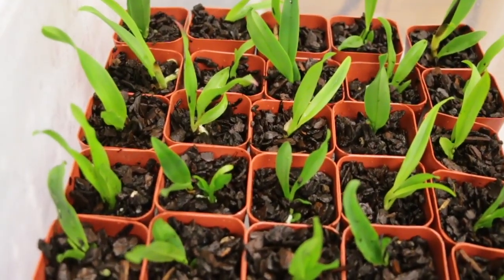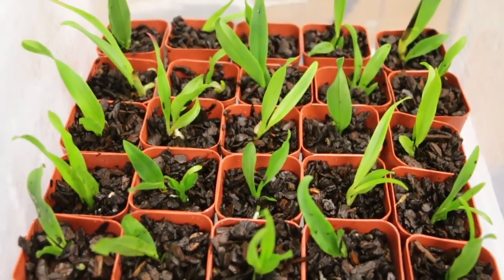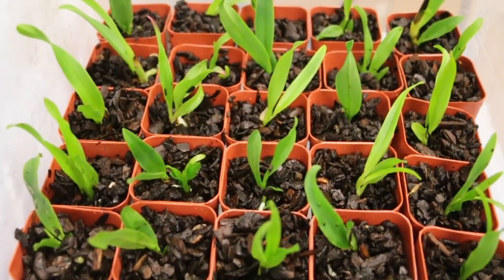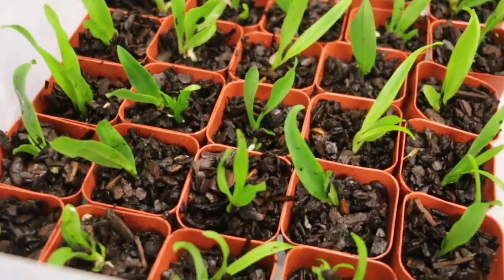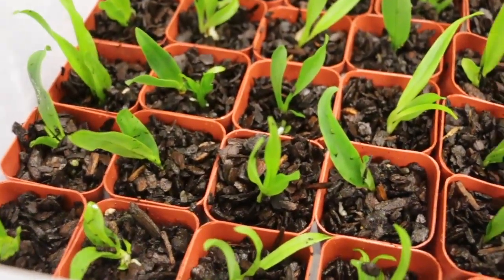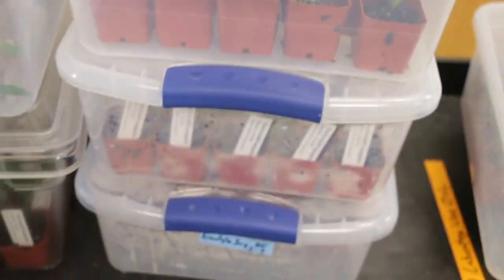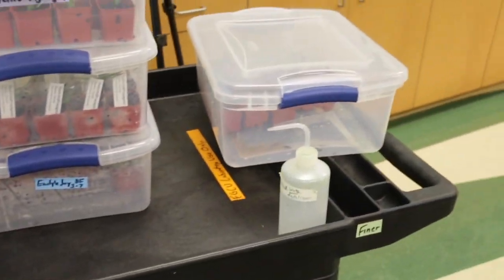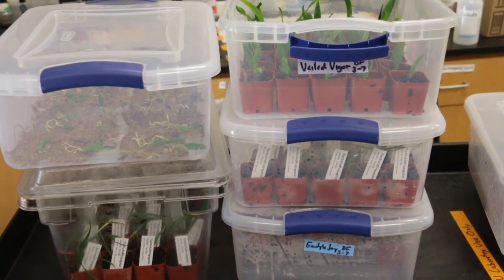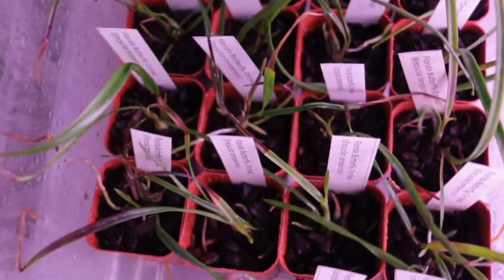I'll do also a weekly fertilizer. In a few weeks, I'll also treat them with a fungus, with a mycorrhizal fungus preparation. It seems to be doing pretty well, and we'll take a look at some of the plants that I've treated previously. Okay, so these are the ones that I did today right here, and let's take a look in the culture room, and I'll show you some after different amounts of time and what they look like. Okay, and we're back.